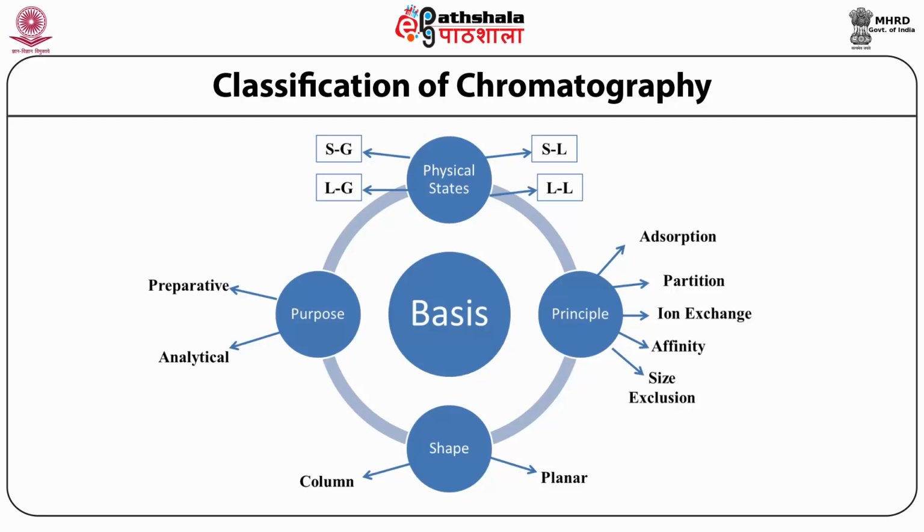This is also exclusively applied in column types as preparative column chromatography. Analytical chromatography. This type of chromatography seeks to measure the relative proportions of analytes in a mixture. The sample size applied or injected is very small, and the purpose of this is to identify and analyze the components in the sample and to quantify their individual concentrations in the sample.